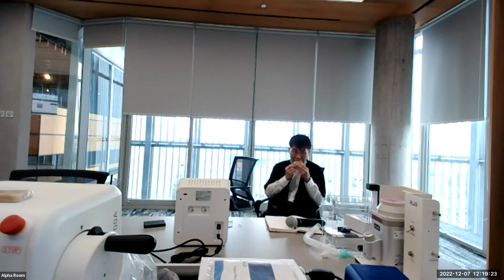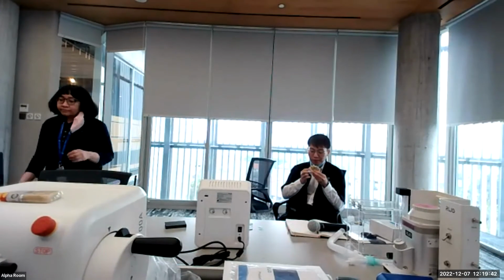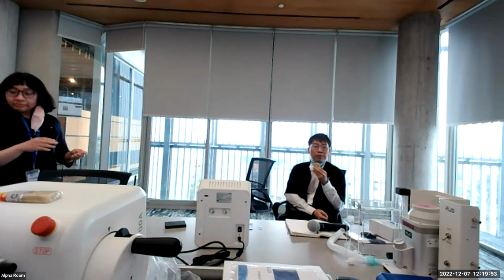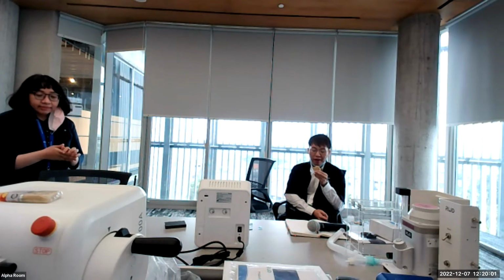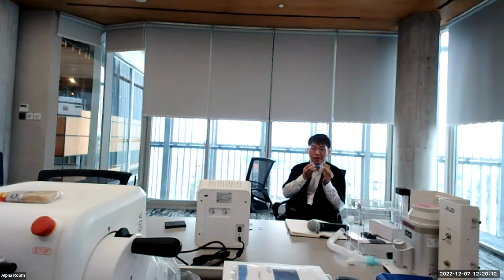Just one. For different organs, do we need different blades? Only this. Different organs, different blades? Yesterday they said it was the same. So this is universal. There are many tissues, including fat, but just one kind. This is the consumable, but one piece we can use for 20 to 30 times. For all kinds of tissue, right? Sample. For the cup, yeah.